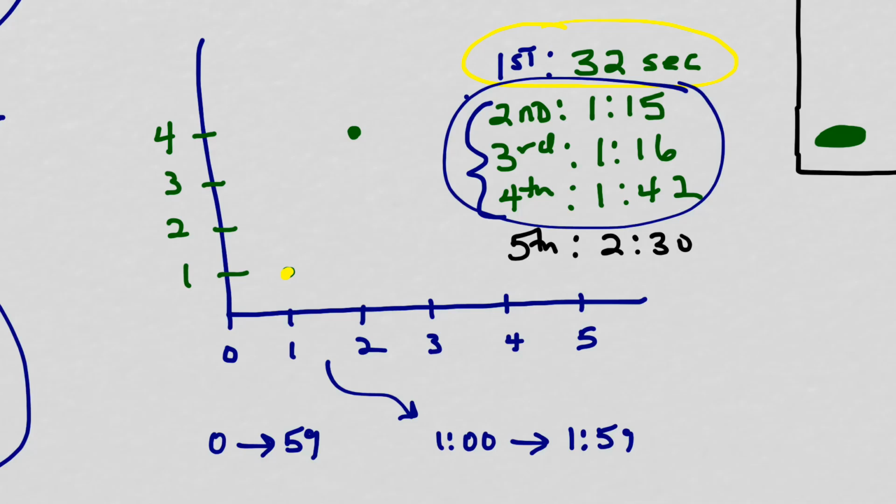Okay, so that doesn't go here. That means I'm going to add to the 4 that I have, and there's my 5th disk. So this would be the 5th disk, and it would be here. So you can see I'm adding a cumulative amount every time. So the grouping of 3 would be 3.